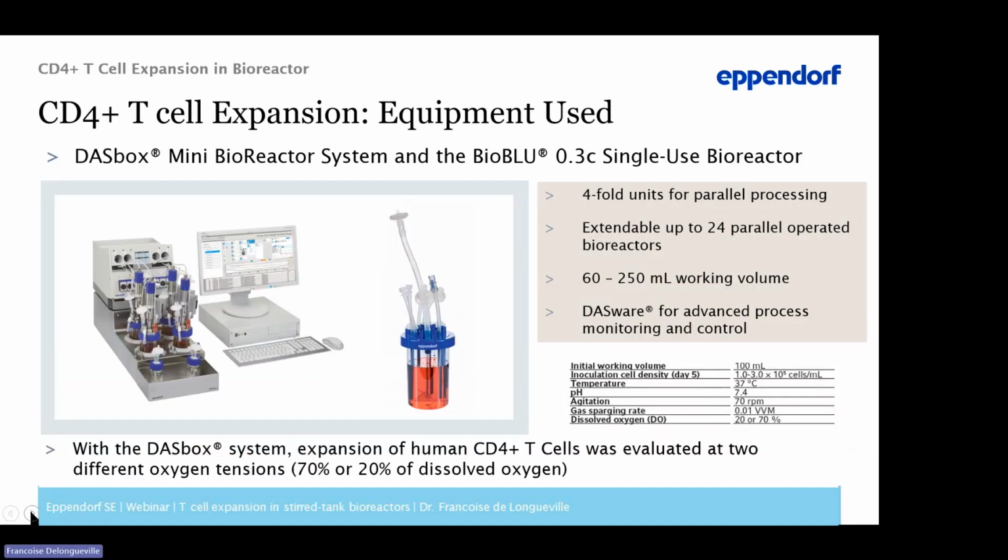In this study, we have shown that parallel bioreactor control systems are useful to optimize culture conditions before the scaling up process. They provide a solid basis for optimal yield in subsequent steps from benchtop to production scale. Several studies have demonstrated that the culture of T-cells at different oxygen tension can have a significant impact on cell proliferation, redox status, and apoptosis activation. So, any small change in the culture environment can have a profound consequence for the product quality.